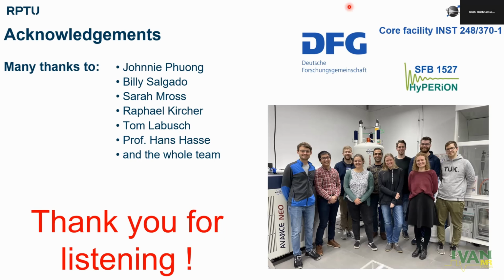I don't know if Andreas Kerner is in the attendees list. This idea of fast reaction monitoring by 2D using time-resolved NUS was proposed several years ago by Andreas Kerner. So it's not my thing. I was impressed by his suggestion that was suggested in one of the SMASH meetings. That's why I remember. So due credit where it is due. So it is Andreas. Thank you, Krish.